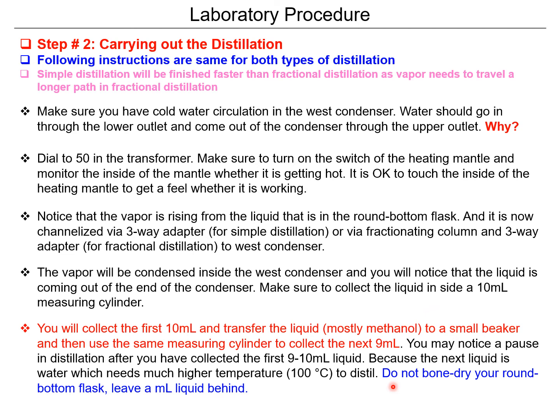One other thing to note, as I mentioned earlier, do not let it become dry because it can be very dangerous. With water, obviously, it won't explode, but oftentimes you use organic solvents, and those have the capability of reacting with oxygen and causing an explosion, right? So you don't want that.